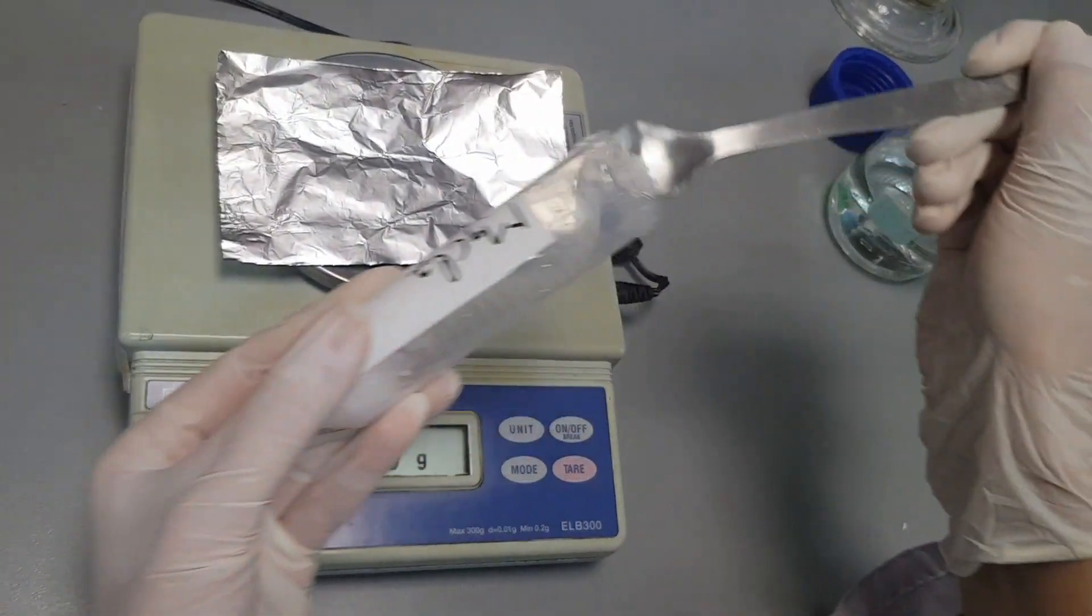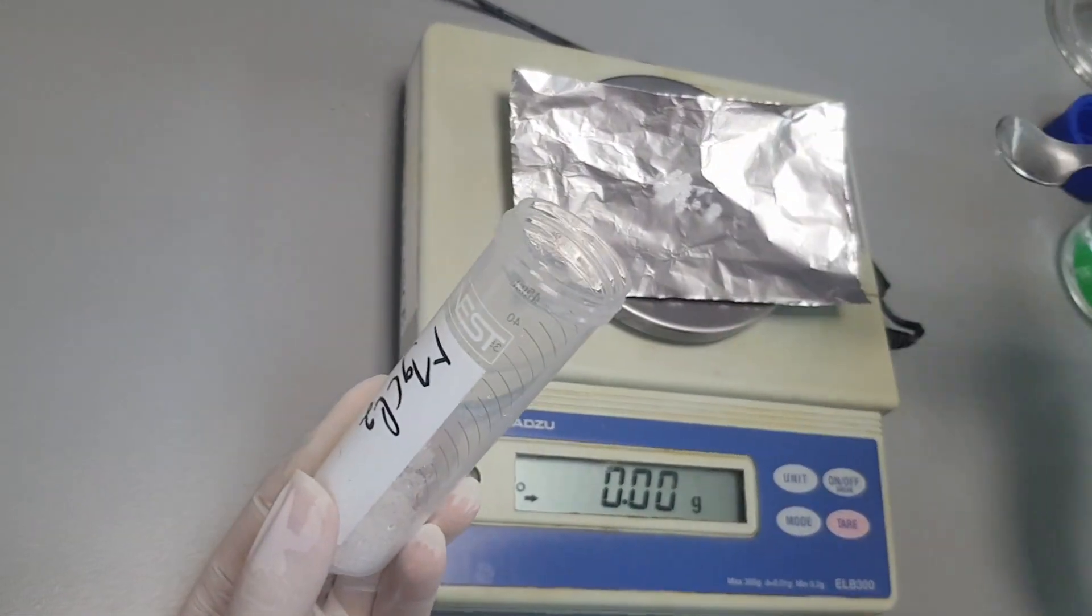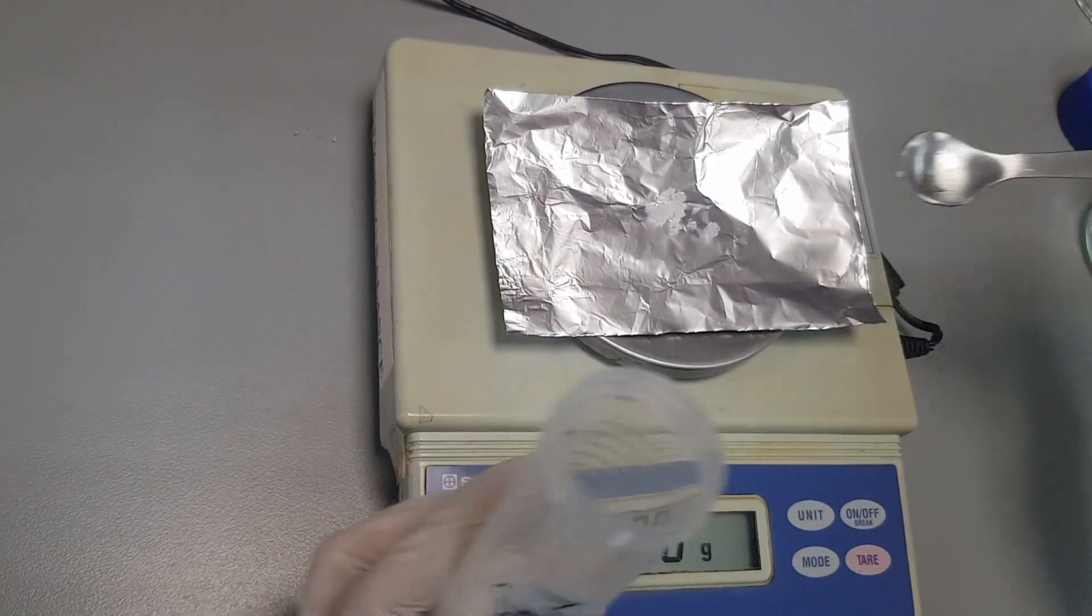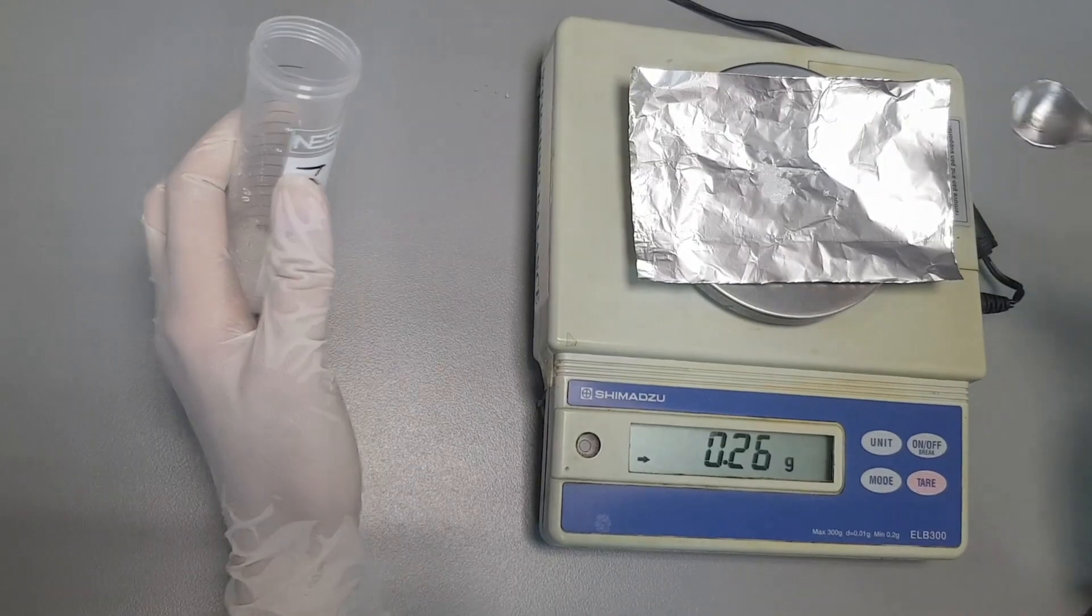Now using a weighing balance, weigh out 0.25 grams of magnesium chloride and add it to the reagent bottle.